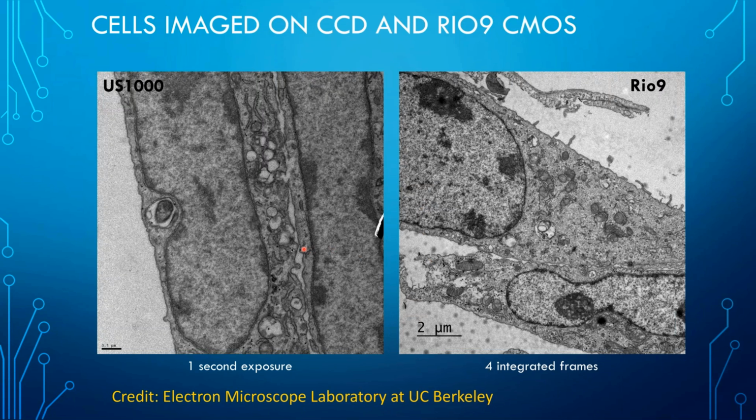Our CCD can do that, but it gets much more skewed when there's anything in the extreme. Of course, the data is captured, but you have to do a lot more post-processing to pull it out. Signal to noise wise, I really felt like the Rio was comparable, if not better, than our CCD, even at high magnifications.